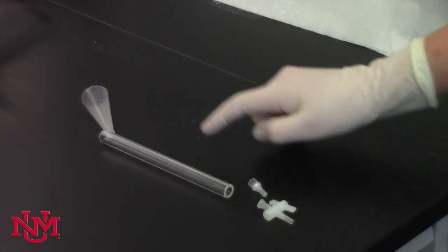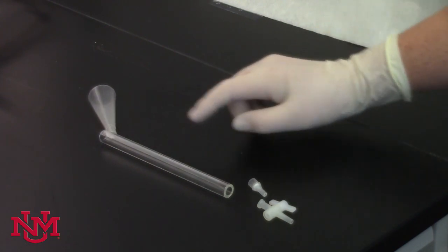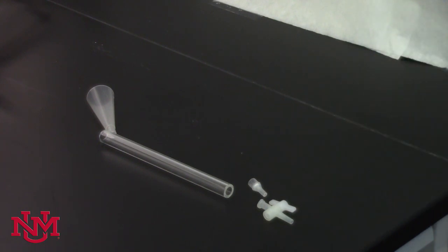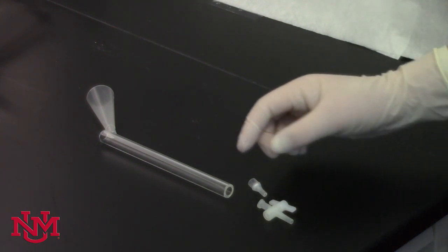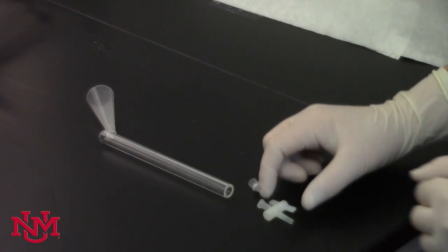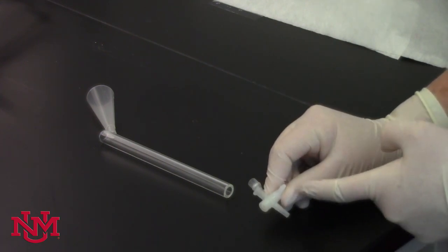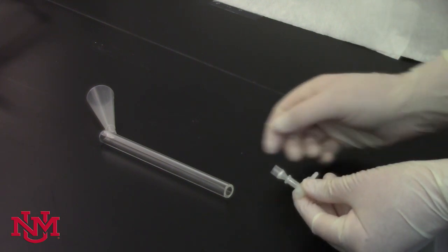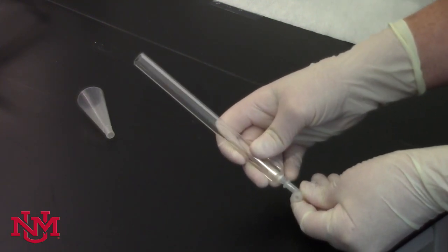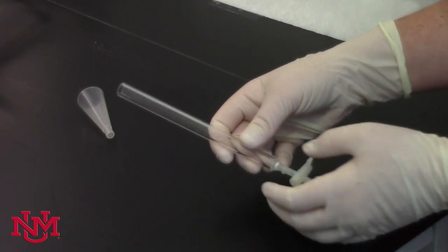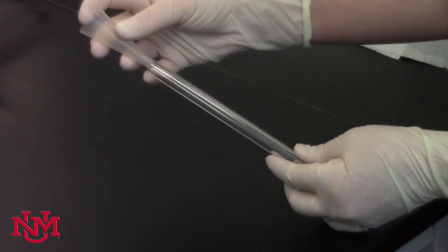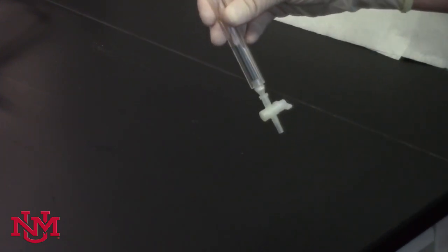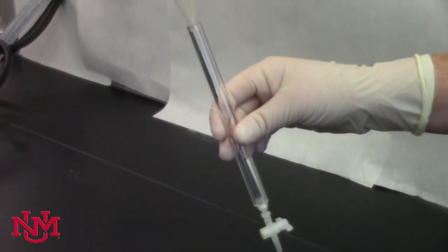You will need your column, column funnel, lure tip, and column stopcock. They're pretty delicate plastic pieces that have to fit in a certain order. The stopcock should be closed at a 90-degree angle and the lure tip fits into the top. That fits into the bottom of the column. Sometimes it gets stuck. The column funnel fits into the top. Once you have all these pieces assembled, you have the column chromatography column set up.